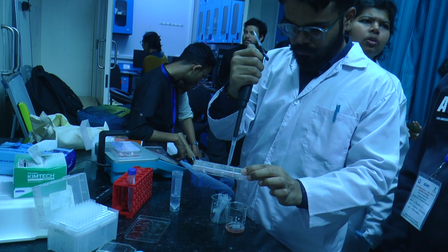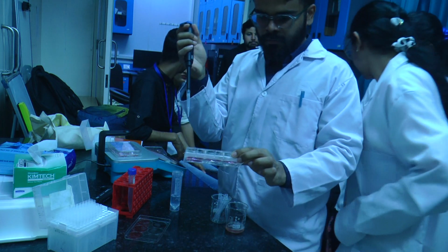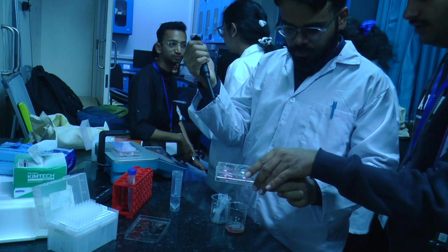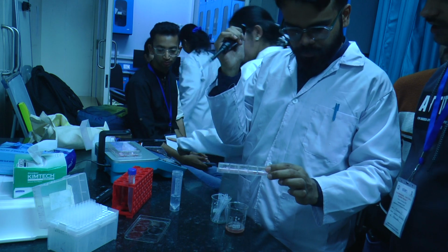Okay, look here once. So discard. Just float it once. Okay. Then now you discard that. This is the same tip. Same tip, same tip.